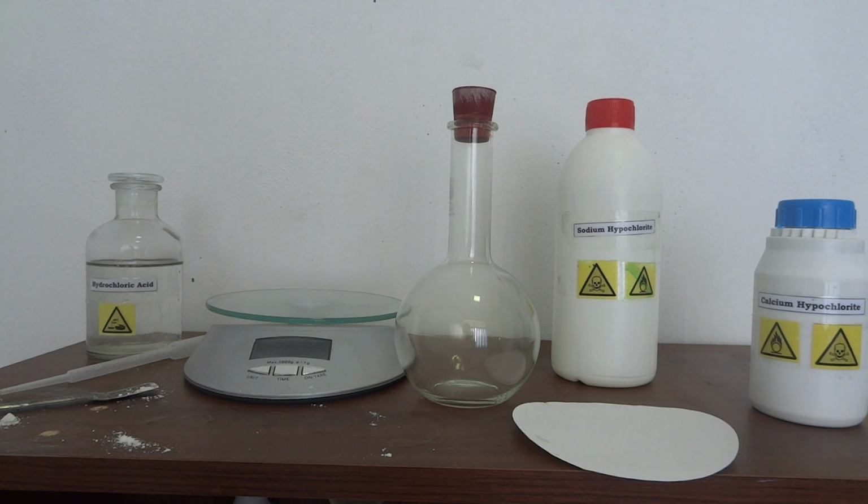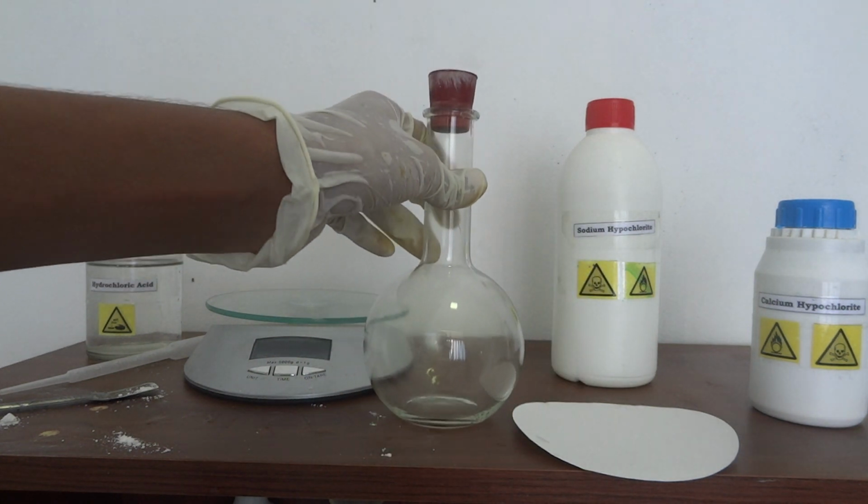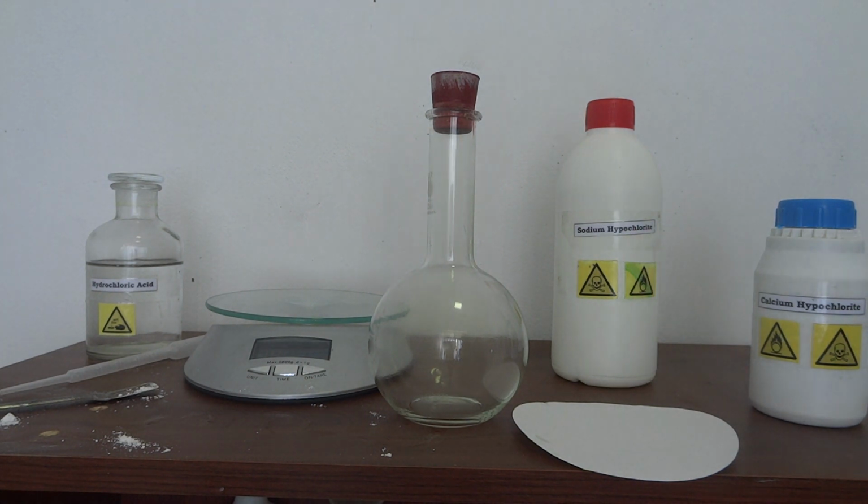So another small experiment is to check the pH by dropping a piece of universal pH paper. So here it is.